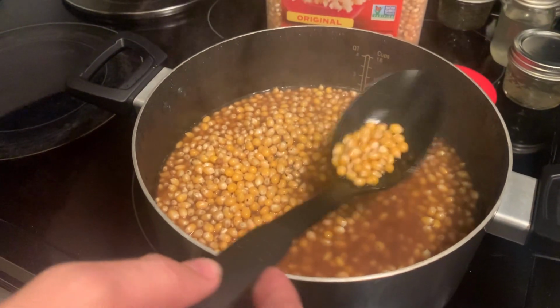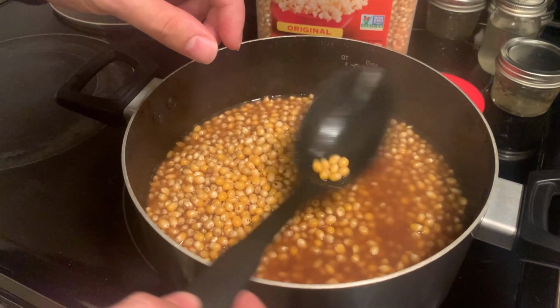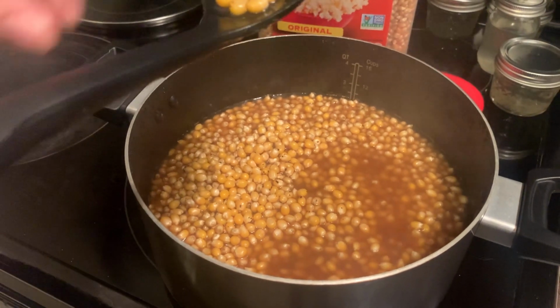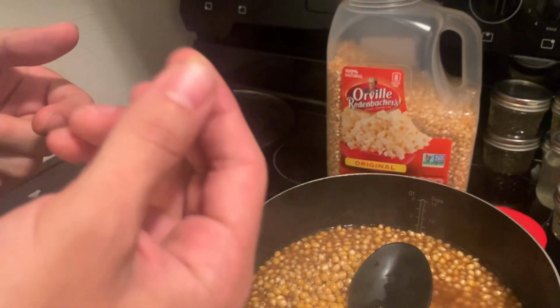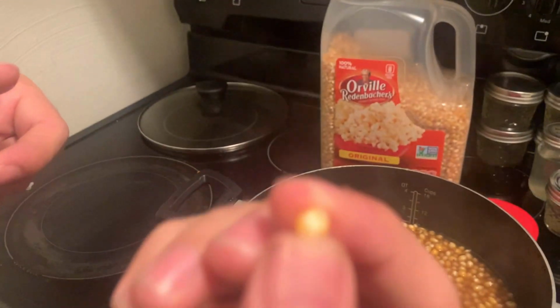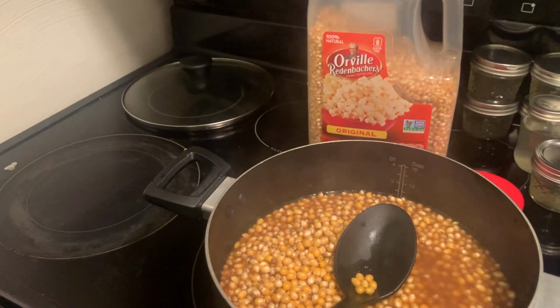If you don't know whether or not these are done, if you can't tell if they're cracked or if they're soft or not, another good way to find out is cool it down so you don't burn your finger. And then you can kind of just take one kernel and bite into it. And if you can bite through and just bite a piece off, they're good to go.